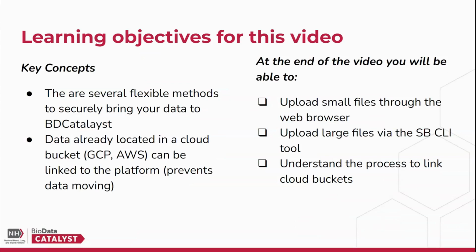At the end of the video, you will be able to do the following: upload small files through the web browser, upload larger files via the 7bridges command line interface tool, also referred to as SBCLI. And finally, you'll be able to understand the process to link Cloud Buckets to your BioData Catalyst account.